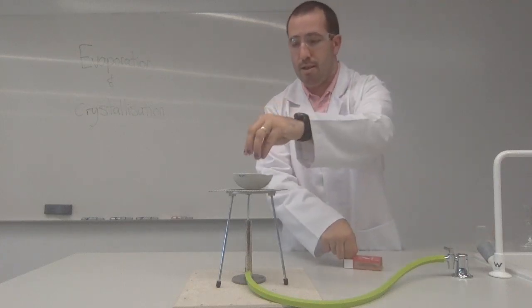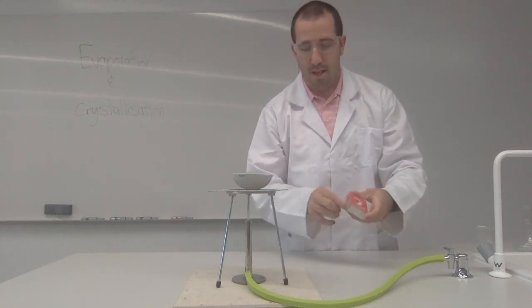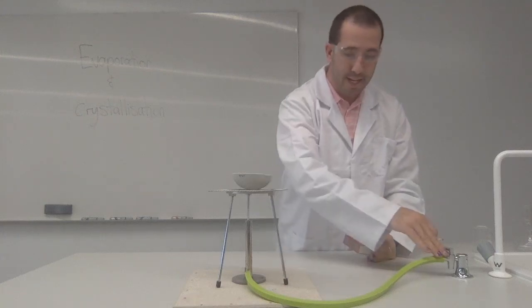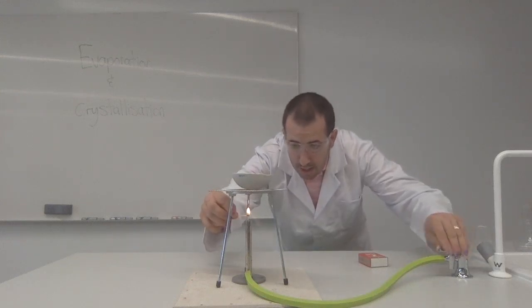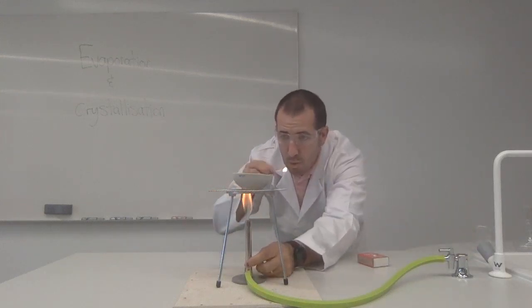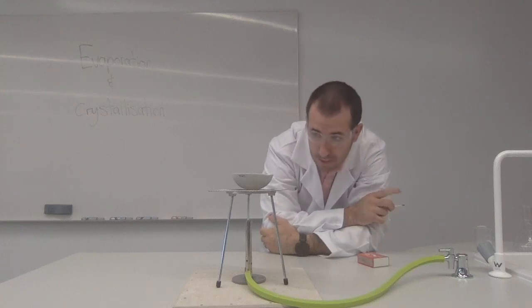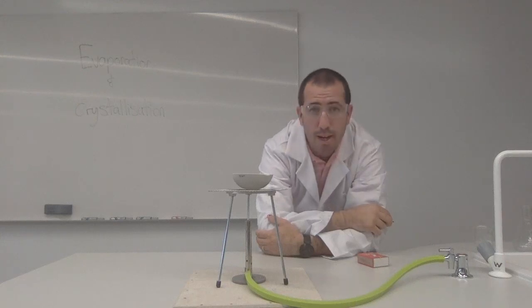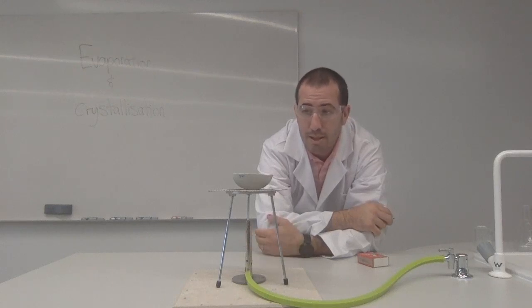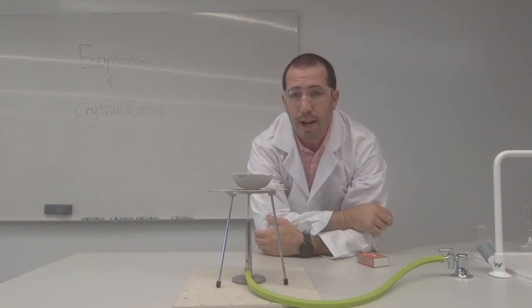So we've got our solution in the evaporating basin, ready to evaporate. Again, it's closed, it's connected, heat mat, all good. So let's do this. And remember, heating flame. That's the one thing that we need to remember. When we're heating, use the heating flame. Now, why is it called the heating flame? One, it is very, very hot. And what's the good thing about hot is that we can heat it up. So what we're going to do now is just heat up the liquid, and it might take a little while.